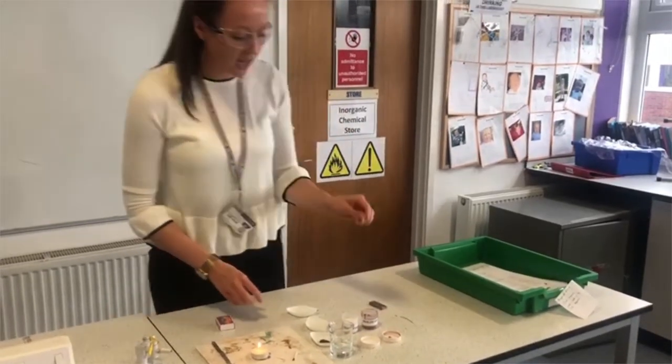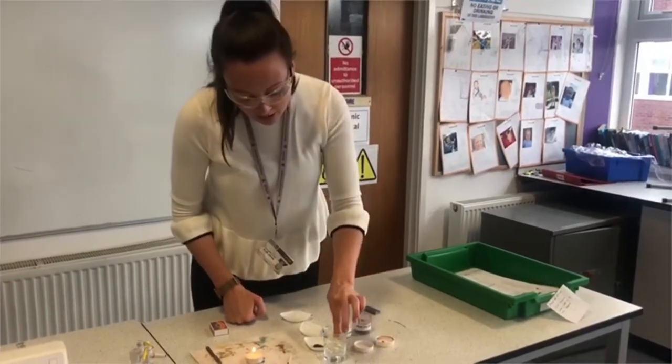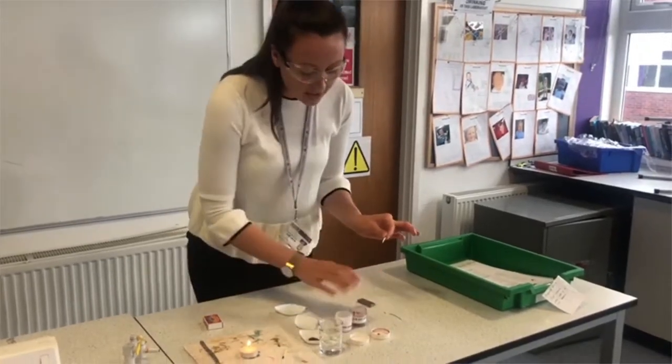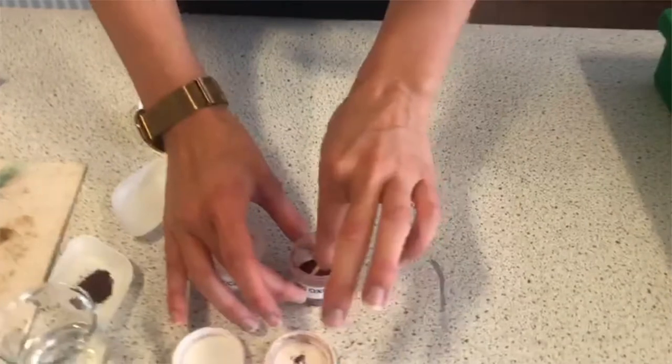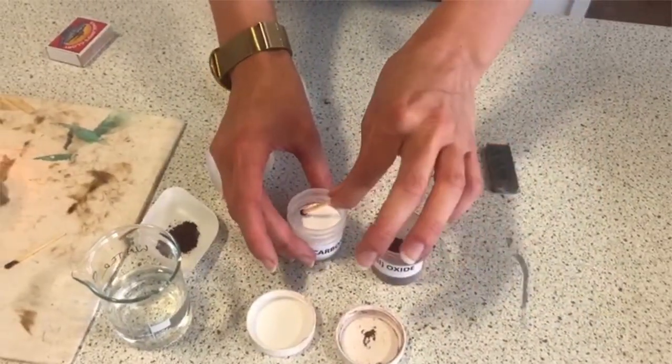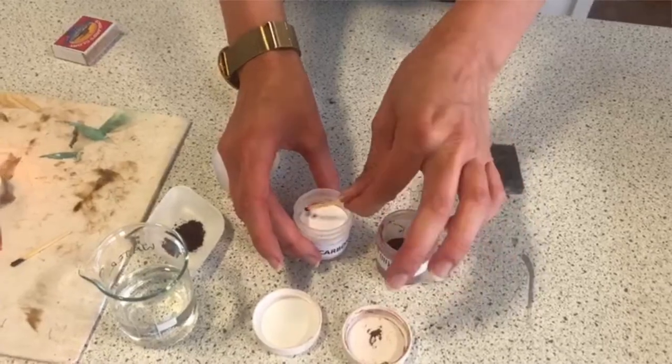I'm going to get another match, and first of all just dampen it in some water to make sure it's a little bit sticky. Then I'm going to put it into my two chemicals — I need my iron oxide on the end and I need some of my sodium carbonate on the end as well.